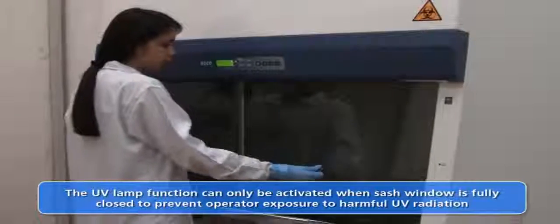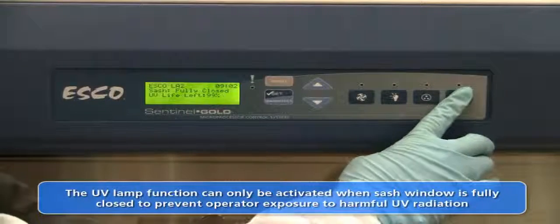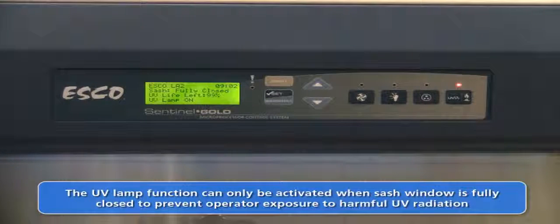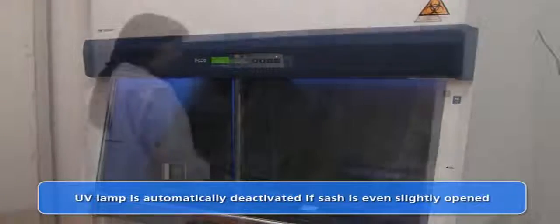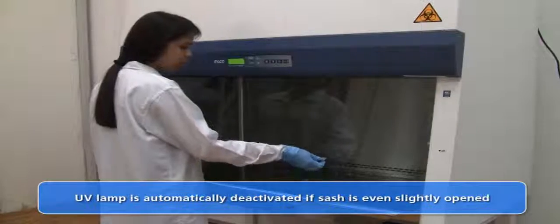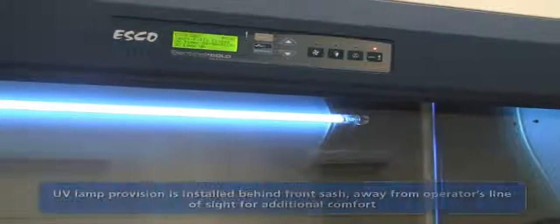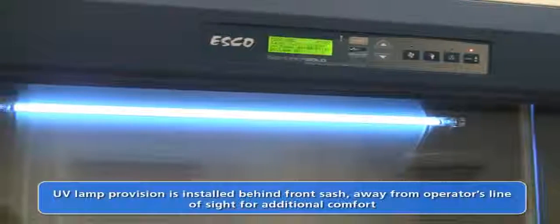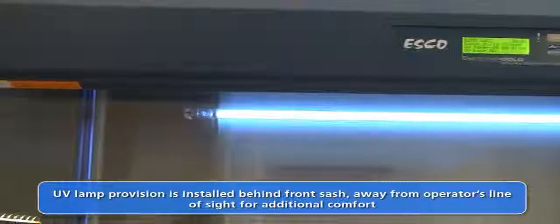The ultraviolet germicidal lamp on the cabinet control system is interlocked with the sash window position for additional safety. This means that the UV lamp may not be activated unless the front protective sliding sash is fully closed. The UV lamp is installed out of the operator's line of sight, ensuring protection from direct UV radiation.